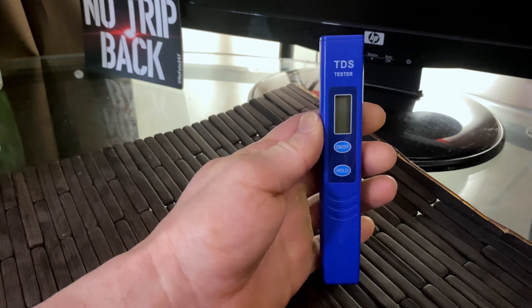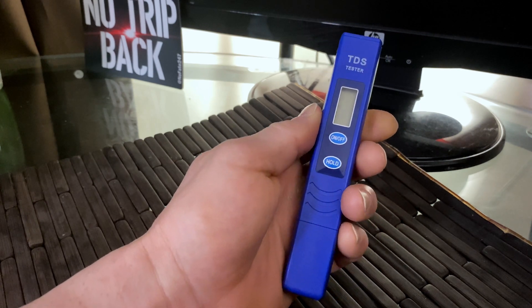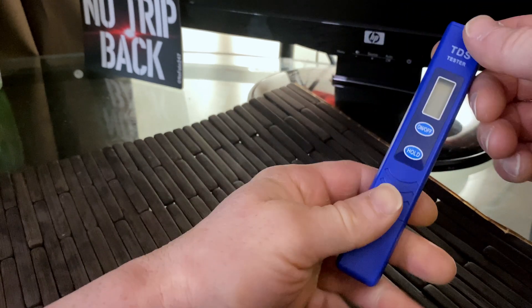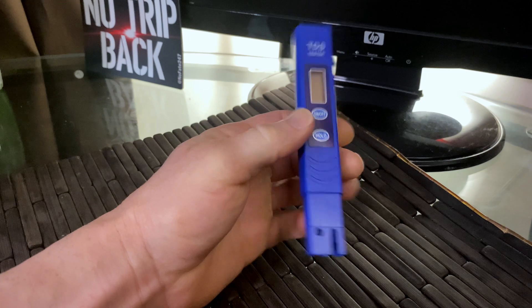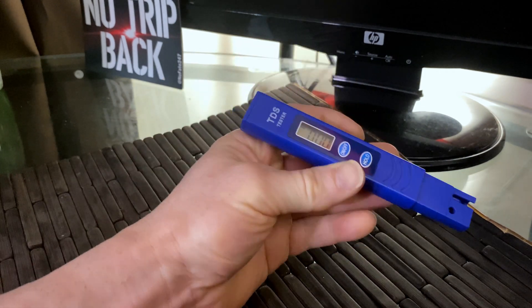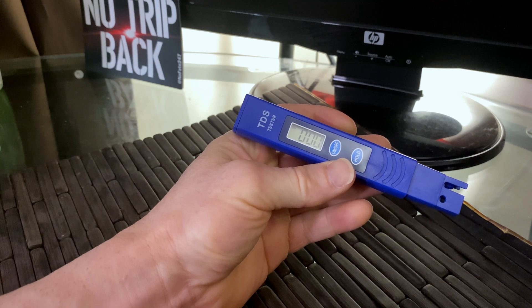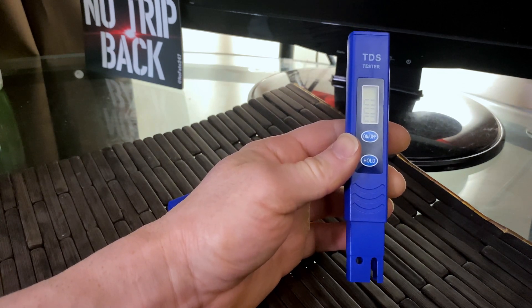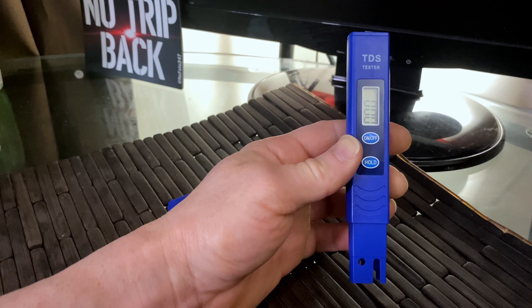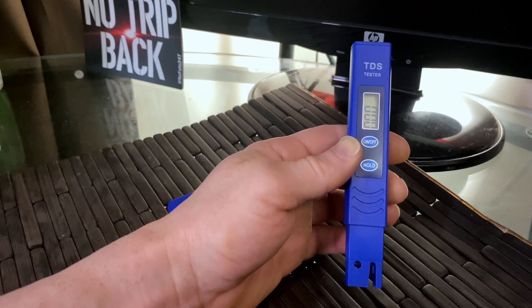That's where a TDS meter, like you see here — there are different versions, they all look very similar — comes into play. How does this work? You take the cover off, put this into water, and turn it on. Zero is obviously the best. Anything above zero, the higher the number, the worse it is. Think about zero as distilled water — 100% H2O, no minerals, no anything. Oftentimes we don't know the quality of our water; we assume it's good just based on the taste, but you can't see the small parts-per-million particles that are in there.